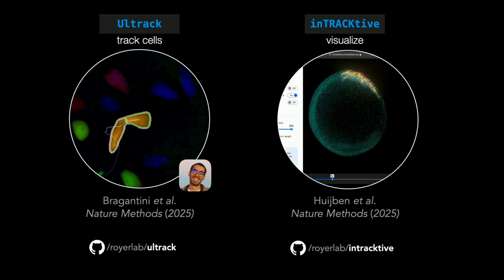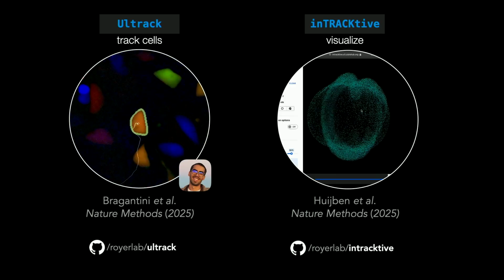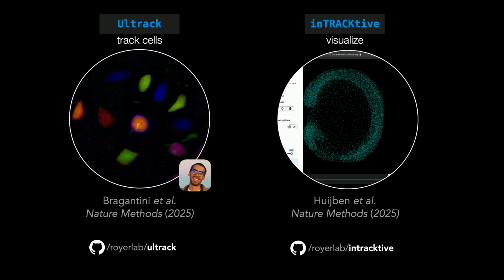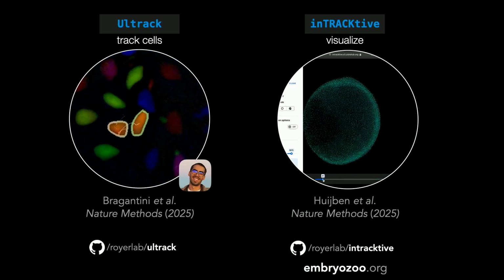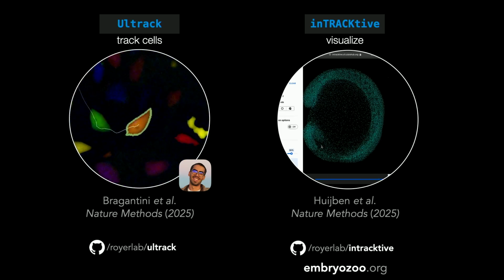All the code and tools are fully open source on GitHub, so check it out. Ask us if you have any questions or to get started with it or if you find any bugs, we're very happy to help you there. And of course the Embryo Zoo website to play with these embryogenesis data sets.